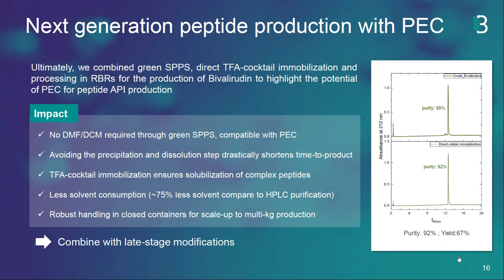Okay. Then one question, I think you already answered this. Do you know what are the side products which are still in your solution after PEC purification? This is what you already commented on also. Then there is a question from Sino Yonkes from Amsterdam. With these greener solvent mixtures, was heating used during coupling? Generally, here we didn't use any heating, but we can also use heating as well. But in this case, we didn't use any heating.